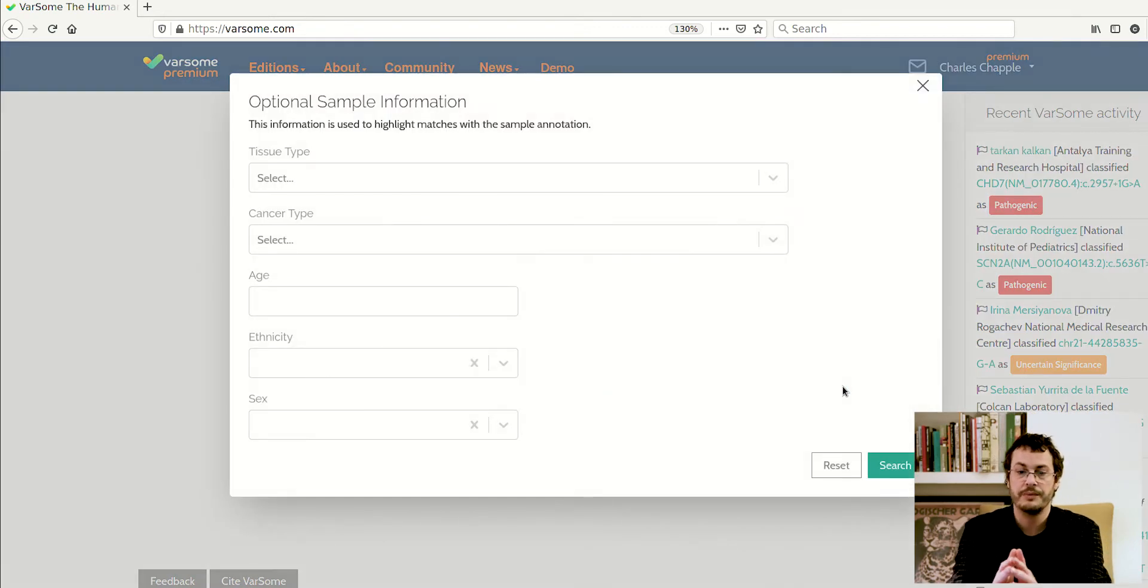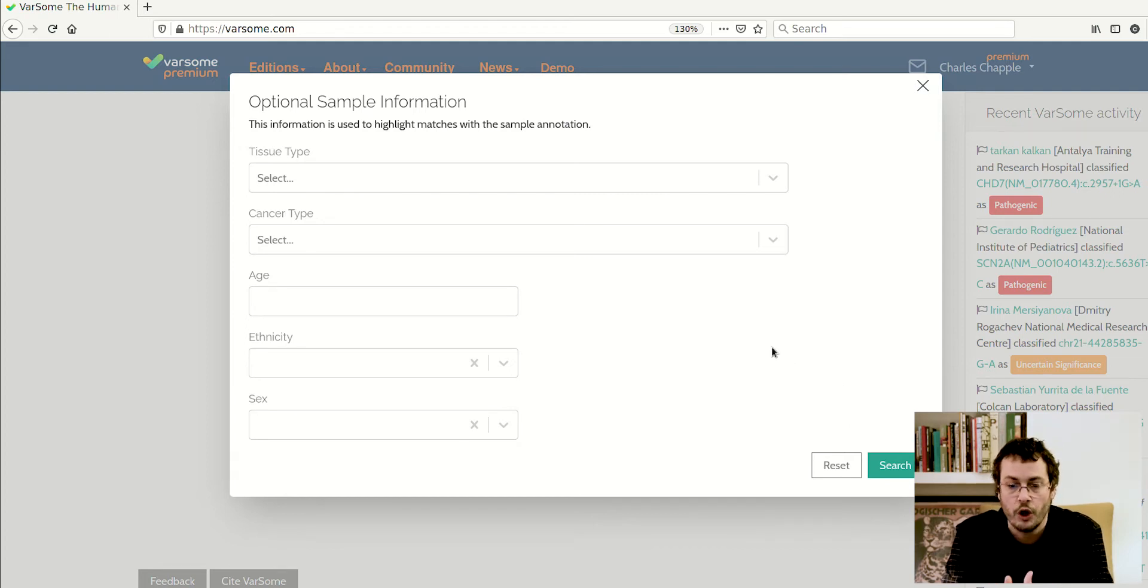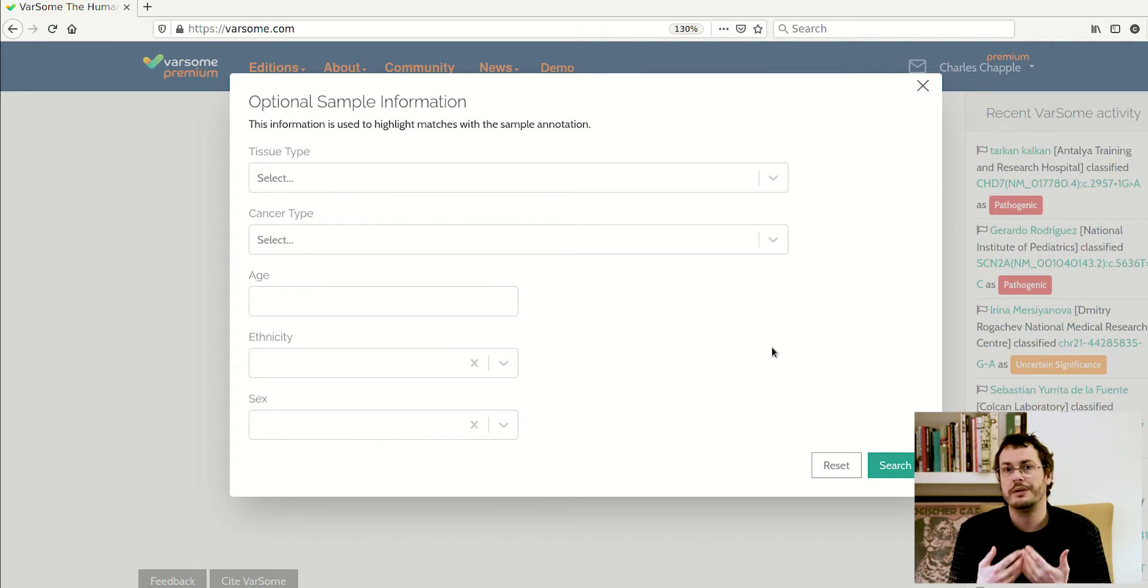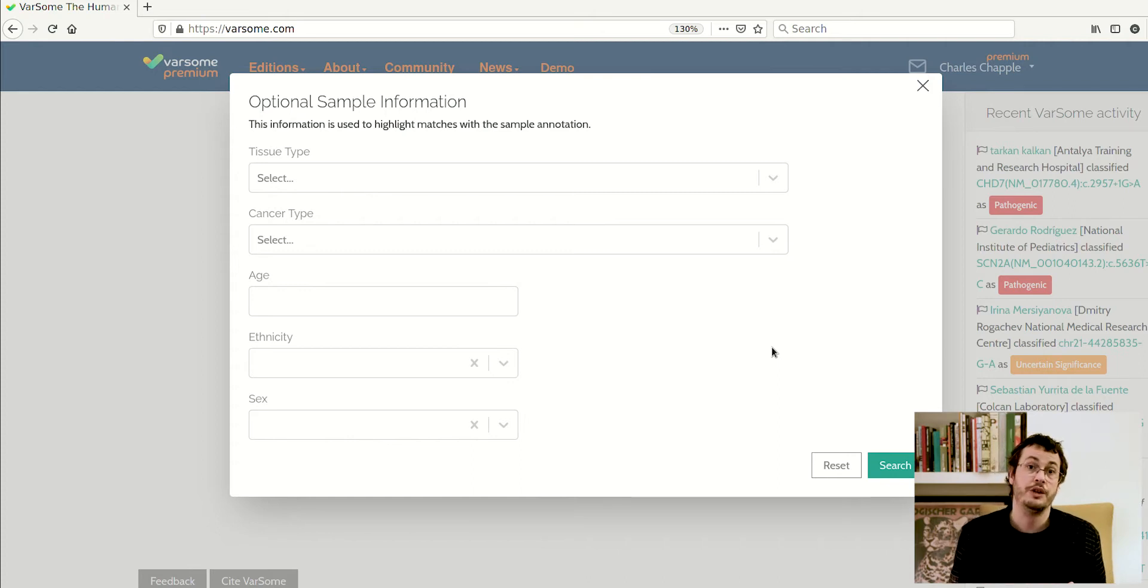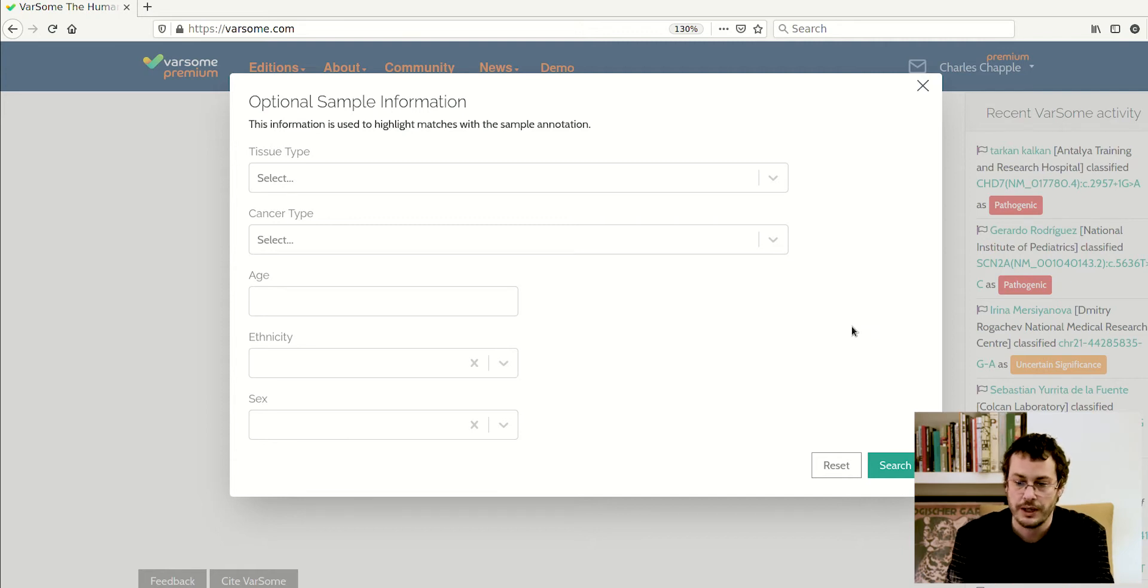This brings up this extra optional sample information window, and as the title says, this is completely optional. But the more detail you give us, the better and more accurate annotations we can give you, because a lot of the AMP rules depend on the sort of information you can enter here.